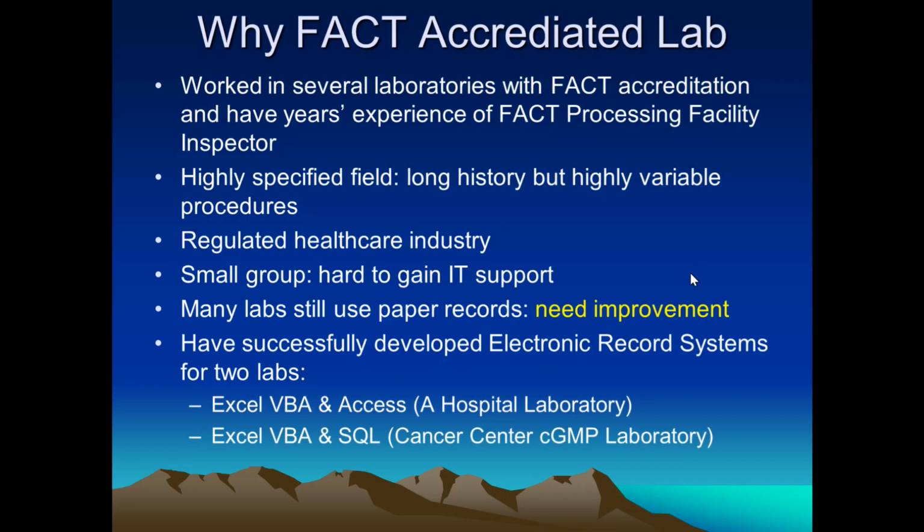Why set it for FACT accredited labs? Because many laboratories that provide service to cellular therapy are hospital based clinical labs, and the majority of them are FACT accredited. So there are some quality control and standards to follow.